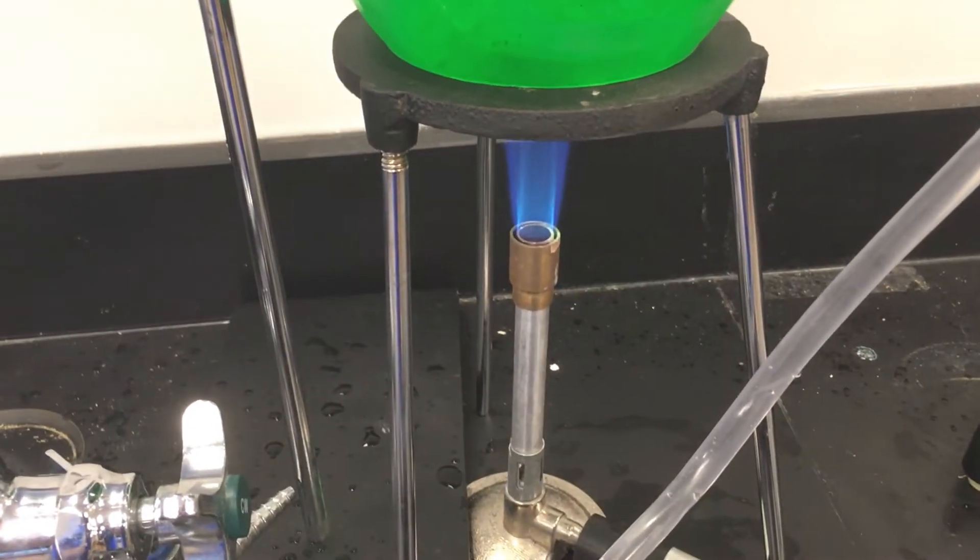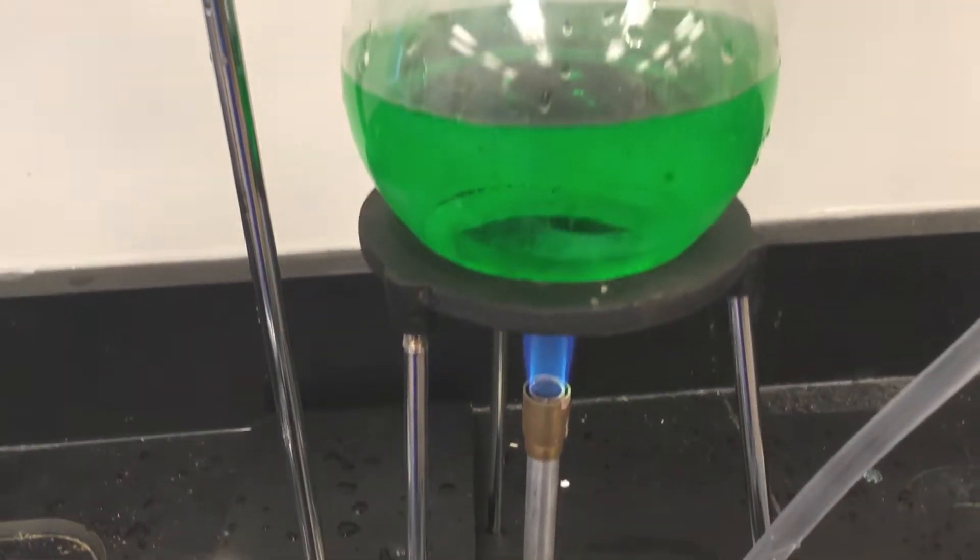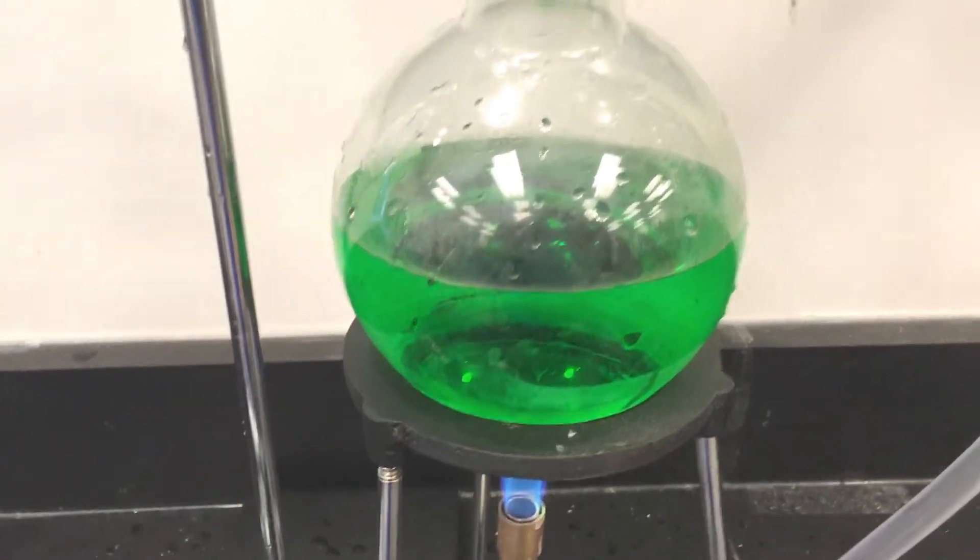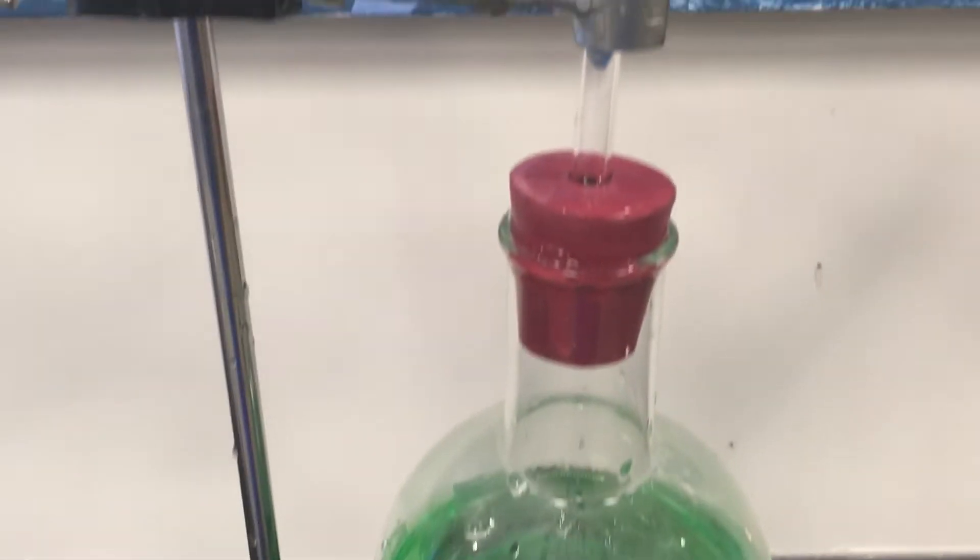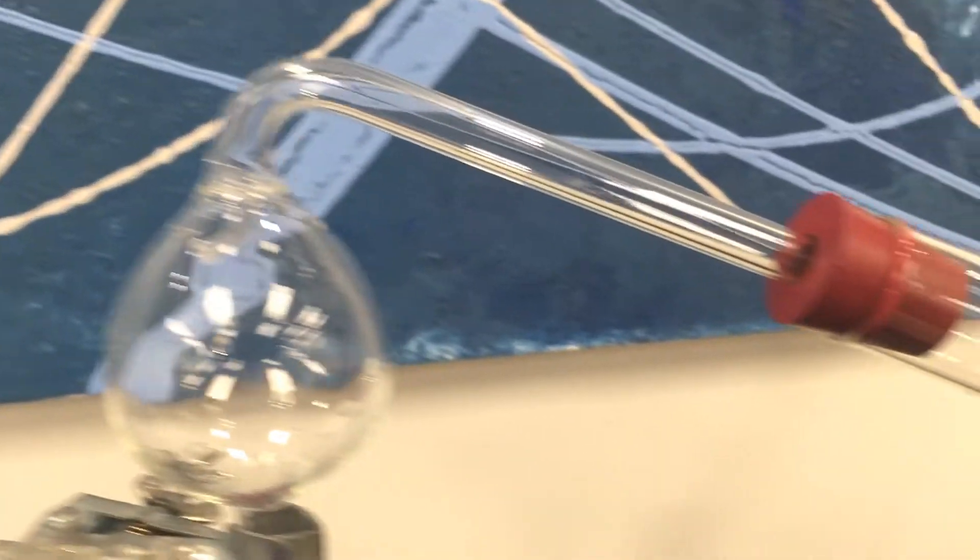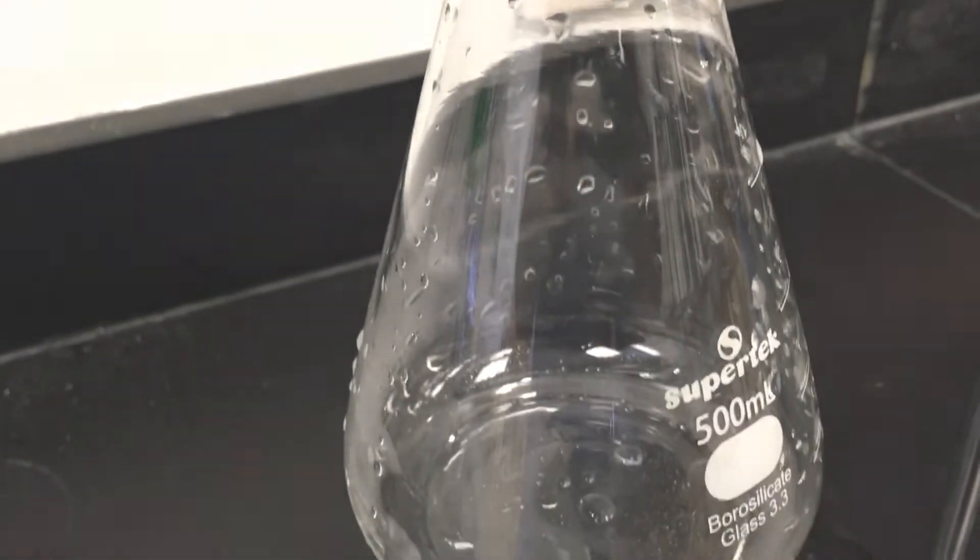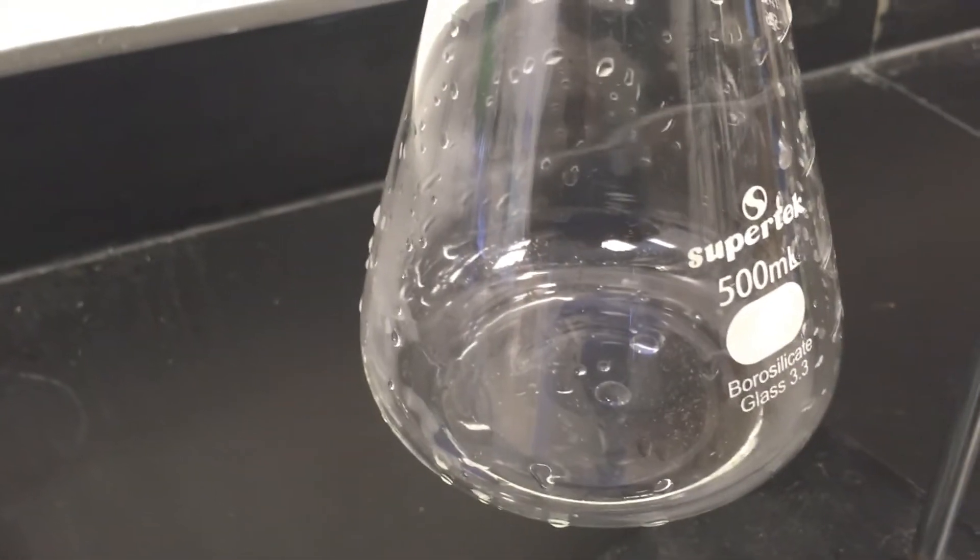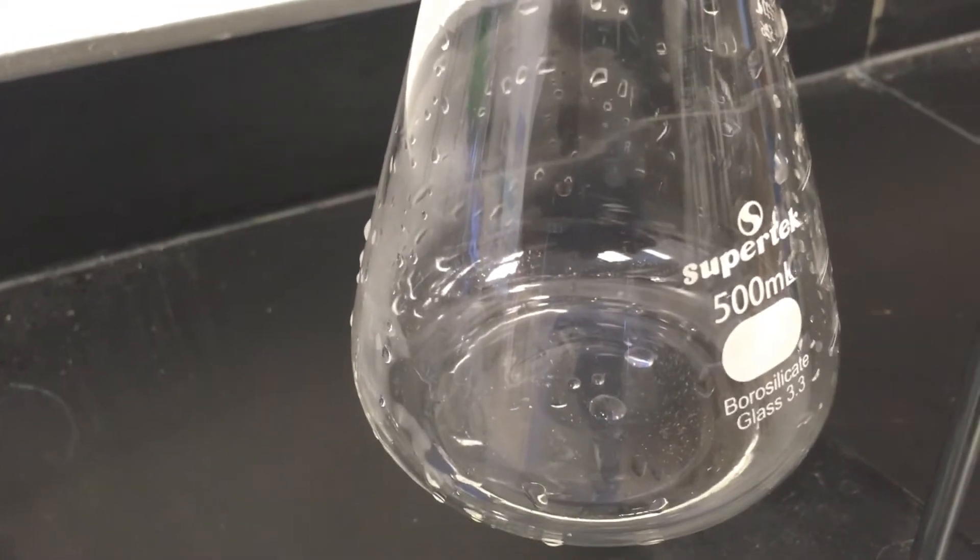All right, here's the process once more. We're going to heat this mixture of food coloring and water. The vapors are going to come up here, they are going to condense running through this condenser and come out here. Now the question is, is it going to be clear? Is it going to be green? Or is it going to be somewhere in between?